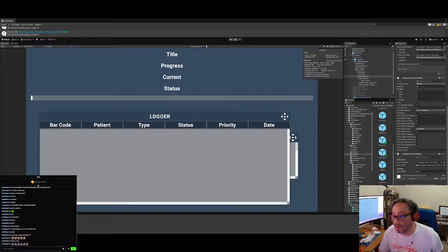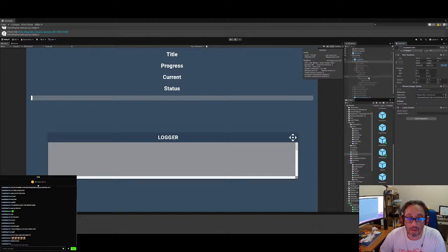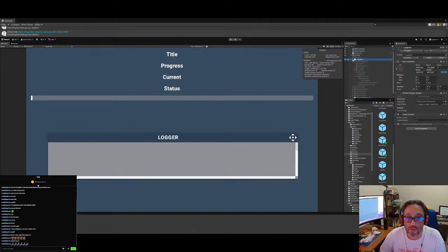This will be a short one today, but we'll get to it as soon as we can. Last time we leveraged the power of just UI, the canvas, and some plugins, and then we used Supabase.